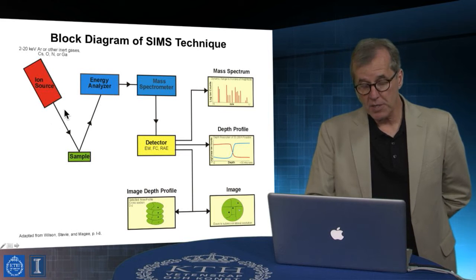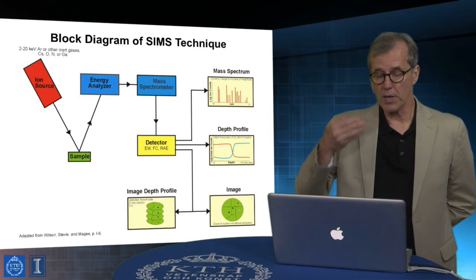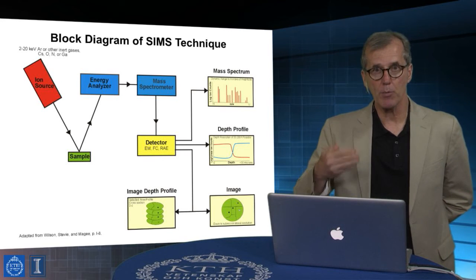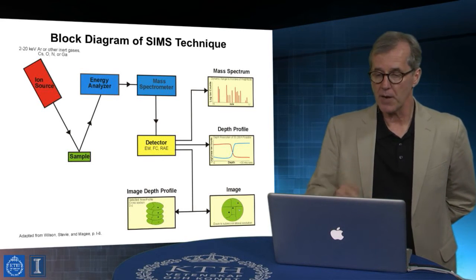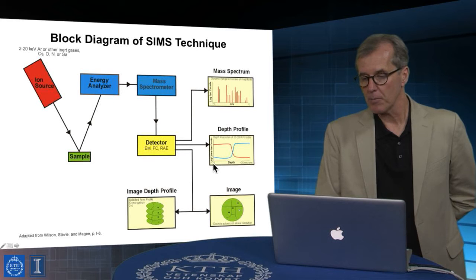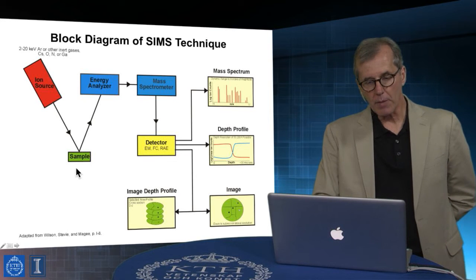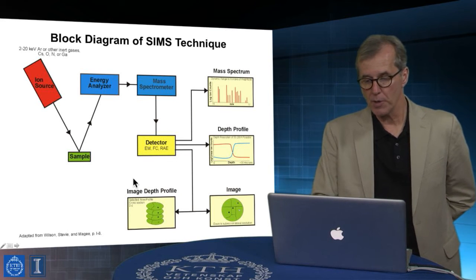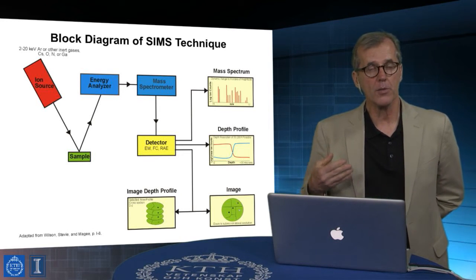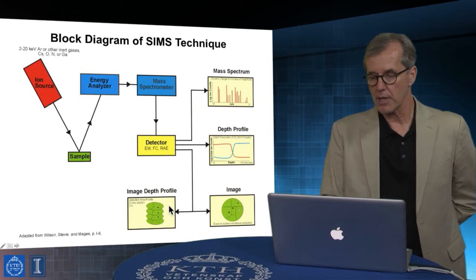Because this is an intrinsically an ion-based technique, depending upon what the ion currents are, we're either drilling slowly into the sample or we're drilling rapidly into the sample via this ion-based milling phenomenon. So in principle, if I sit at a spot, I can actually depth profile by measuring ion yield as a function of time. Because ion beams can be focused to a fine probe, and in state-of-the-art instruments, these probes can be tens of nanometers or even 10 nanometers in diameter. That's how fine the spatial resolution can become.